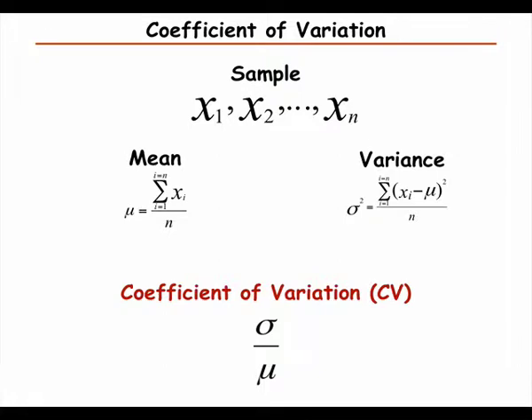The other thing that we usually like to calculate for the measurements is the coefficient of variation, which is simply the standard deviation divided by the mean. And this is for the values of the non-blanks. And of course, this works best if there is a normal distribution, if we sort of implicitly assume that, because then the mean and the standard deviation are better defined.